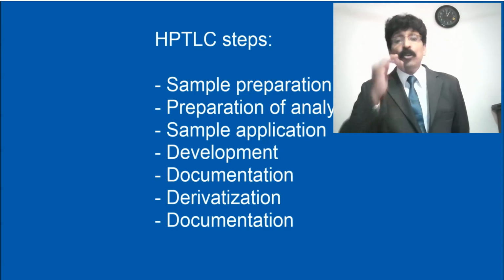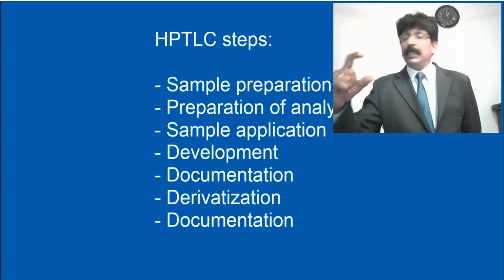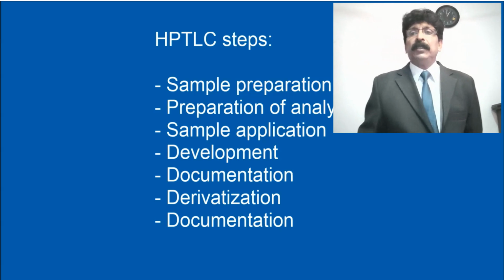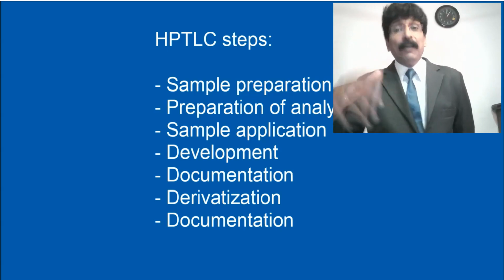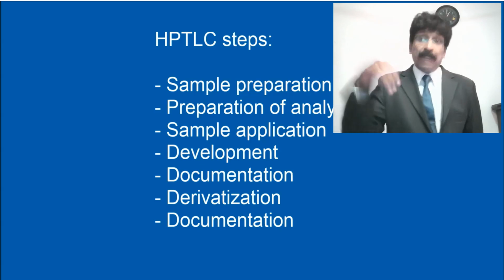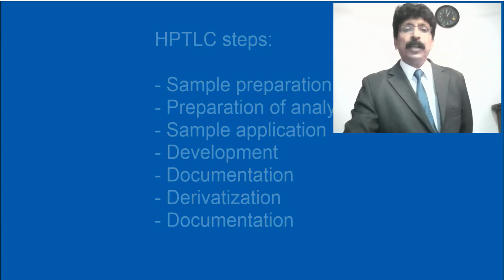But you should know the words sample preparation, preparation of analyte, and there are some vials and all you have to prepare, weigh and add the solvent, and then it will be applied to the instrument directly, by an automatic system. That is ADC, automatic development chamber, which will be there in HPTLC. And next, development automatically, and the documentation on your computer, and derivatization you have to do separately, and again document this compound. You can see now.